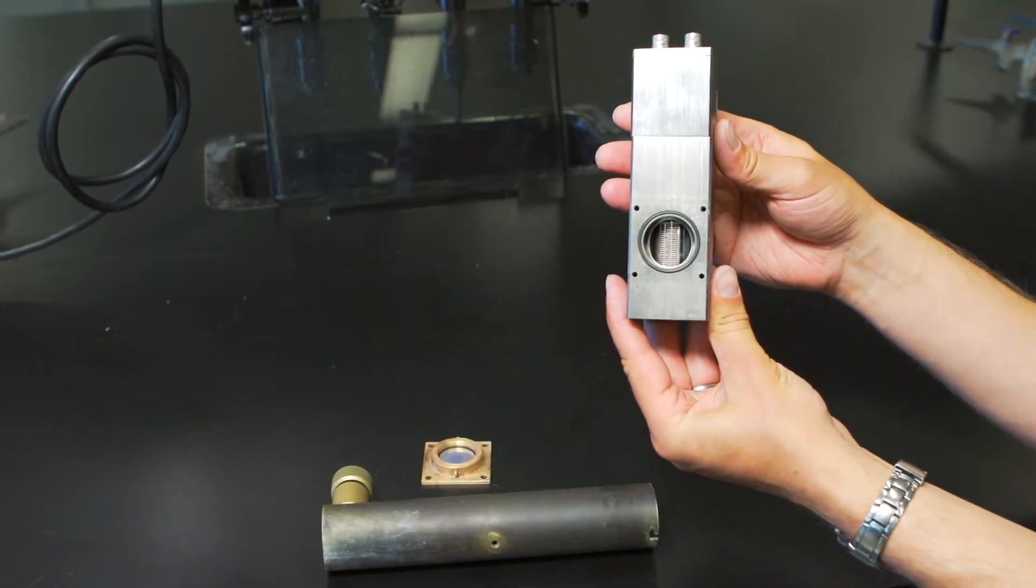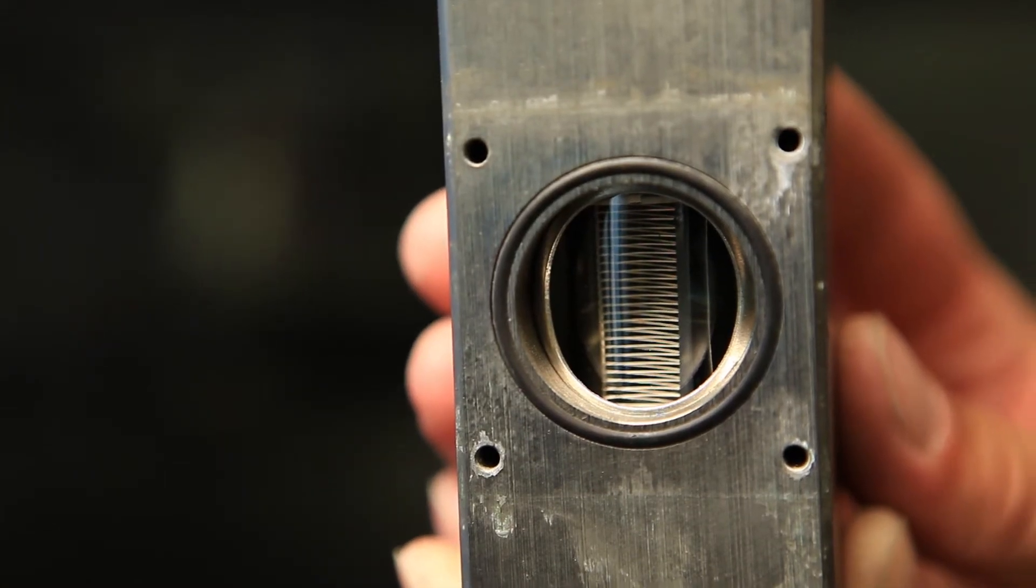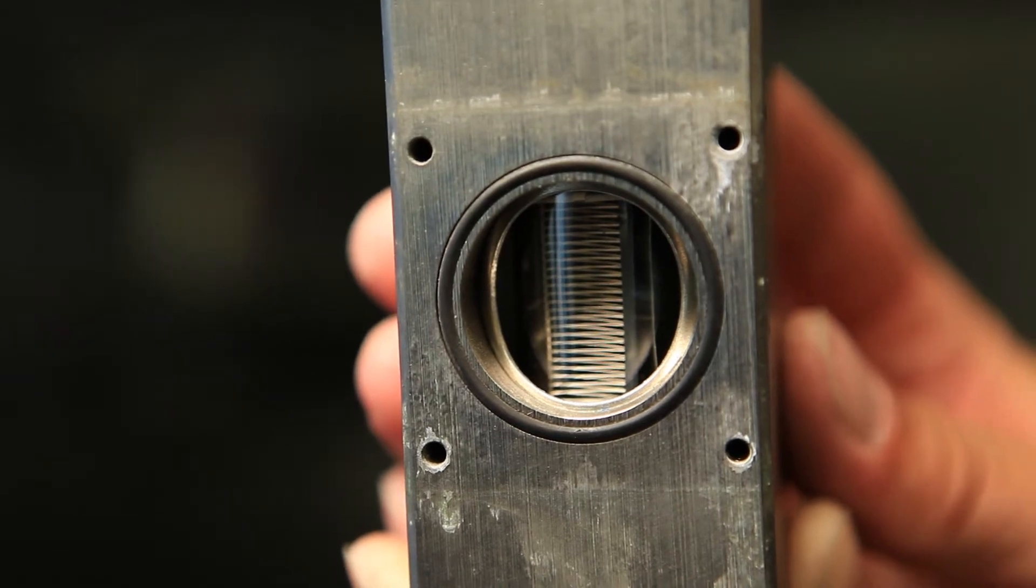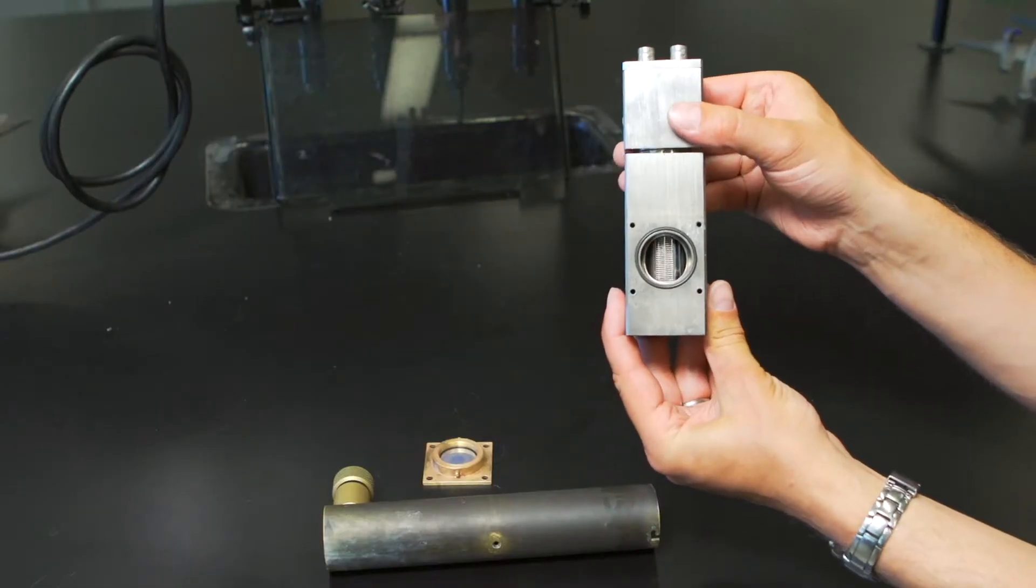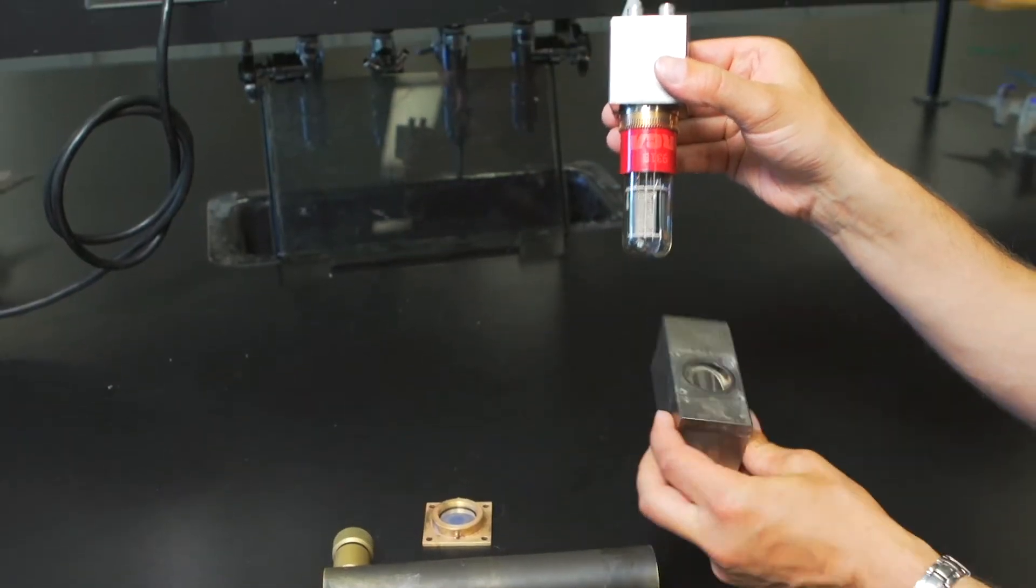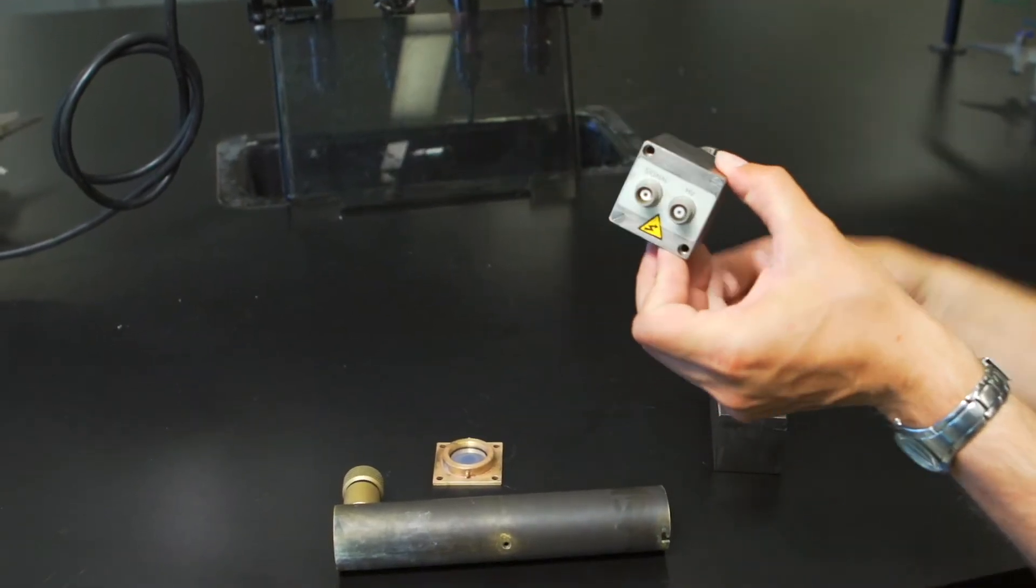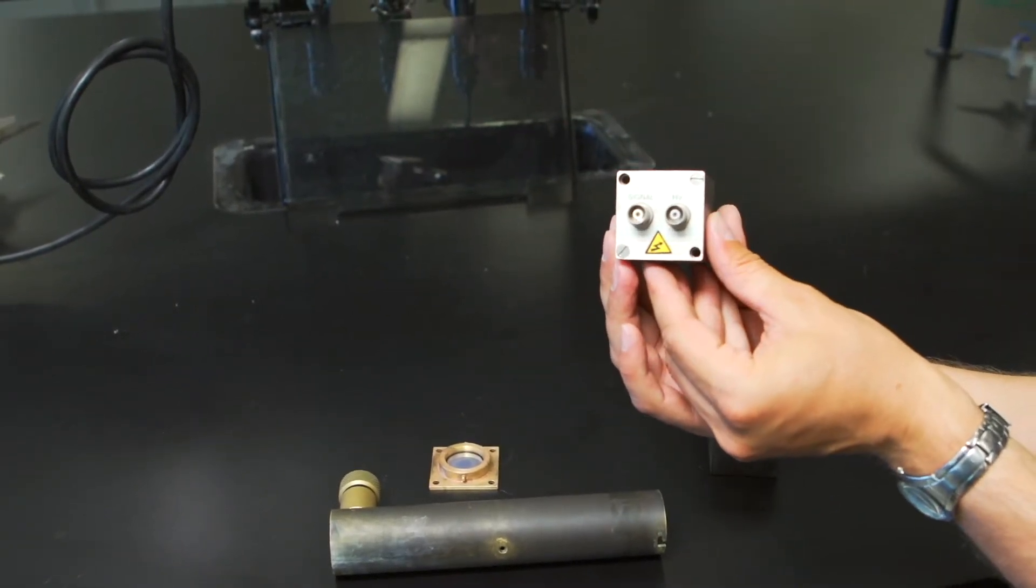The transmitted light is detected by the photomultiplier tube, or PMT, that is directly behind the optical filter. The PMT has two connections. One of them supplies high voltage to the PMT, while the other takes the signal from the PMT to the computer.